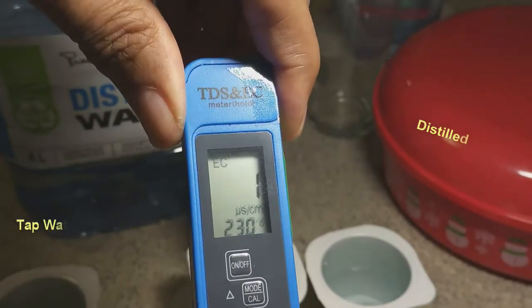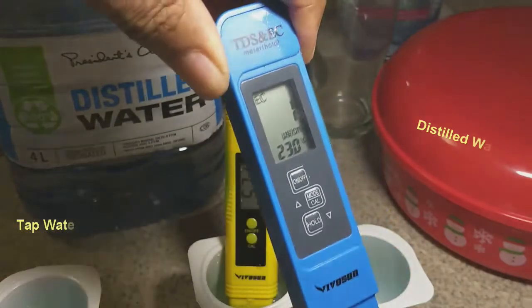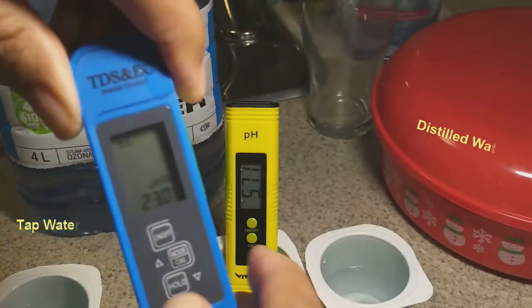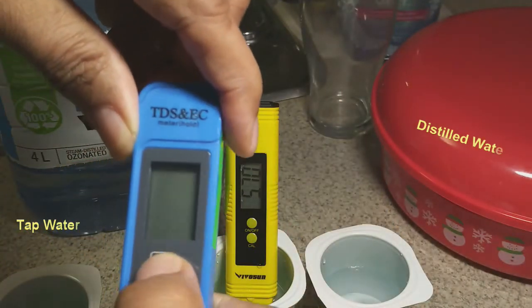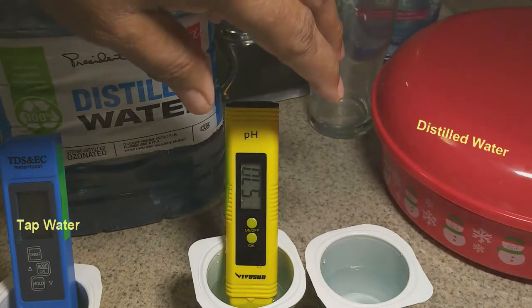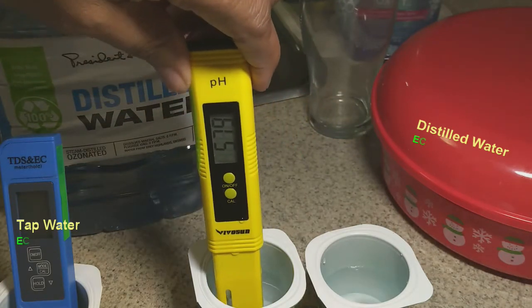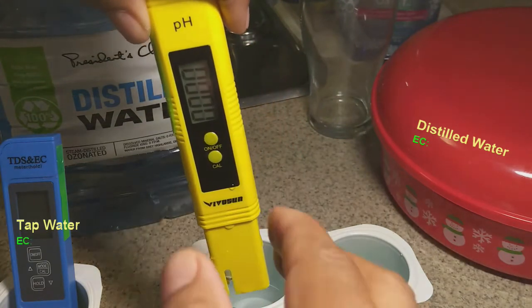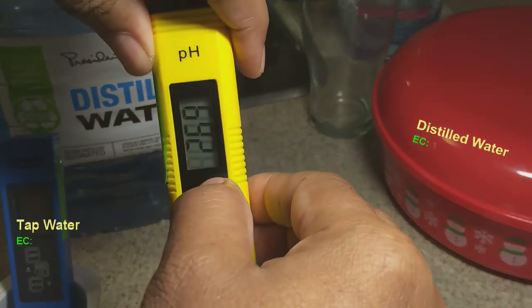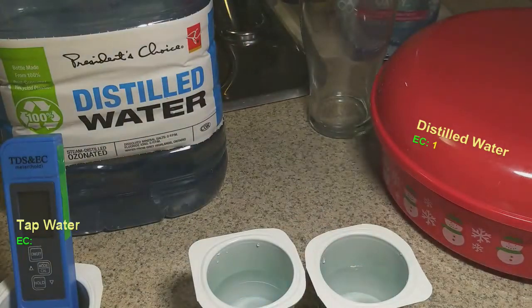This is the EC reading, and you can barely see there's a one — the amount of salts or nutrients inside runs up to one. I'm going to clear this and put it into the tap water. That was about 5.70 — I'm going to clear the pH and put it into the tap water as well.